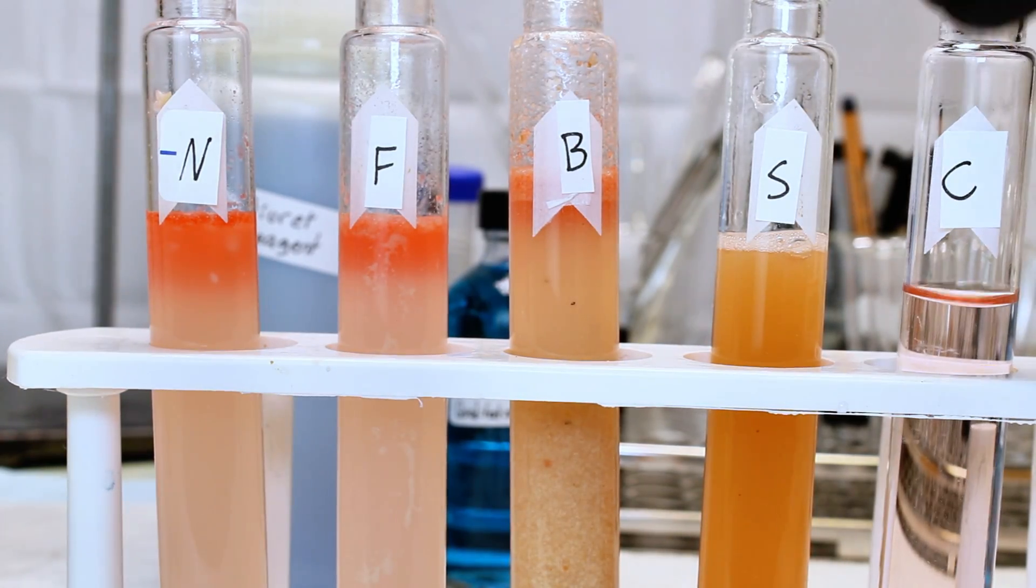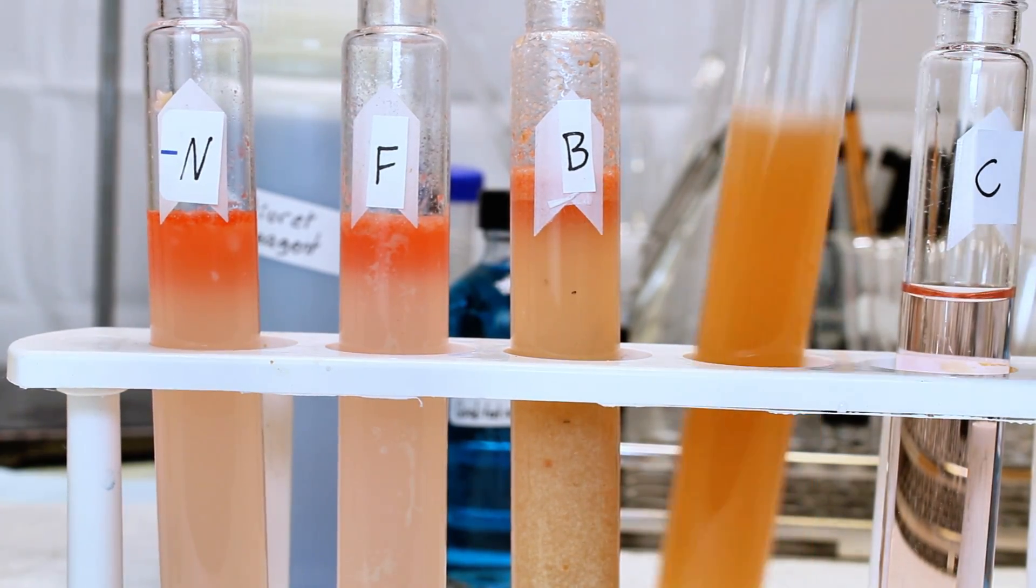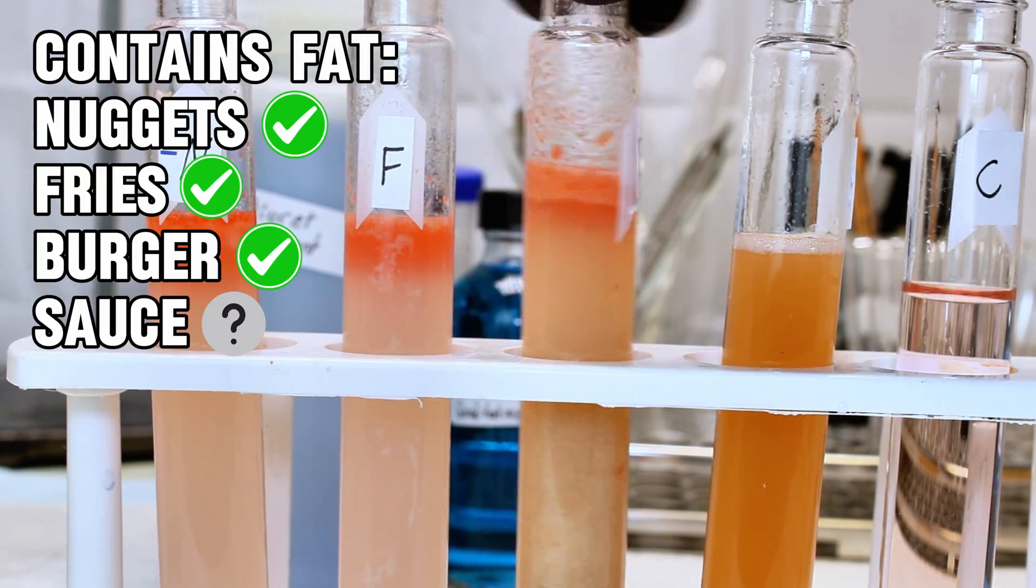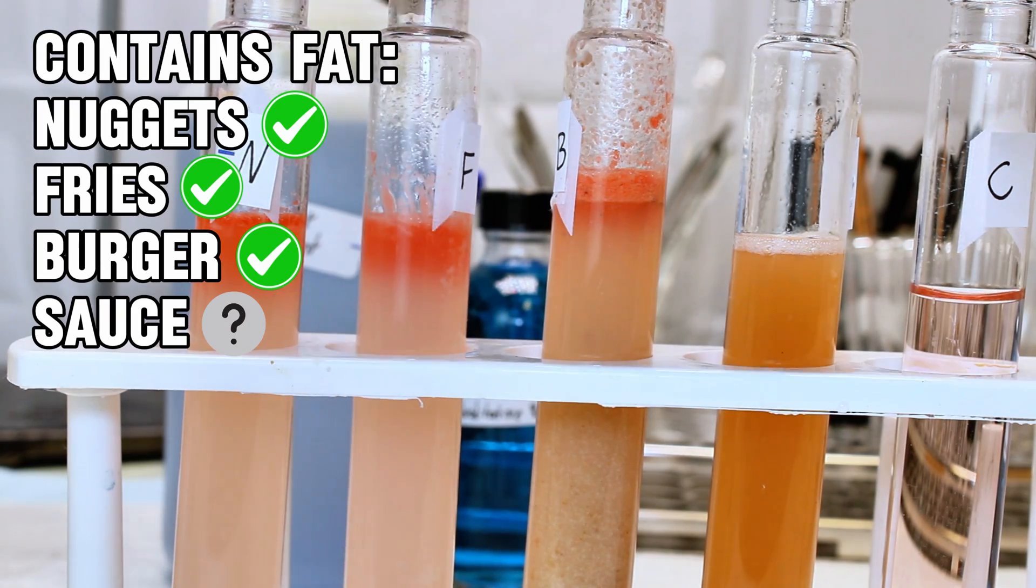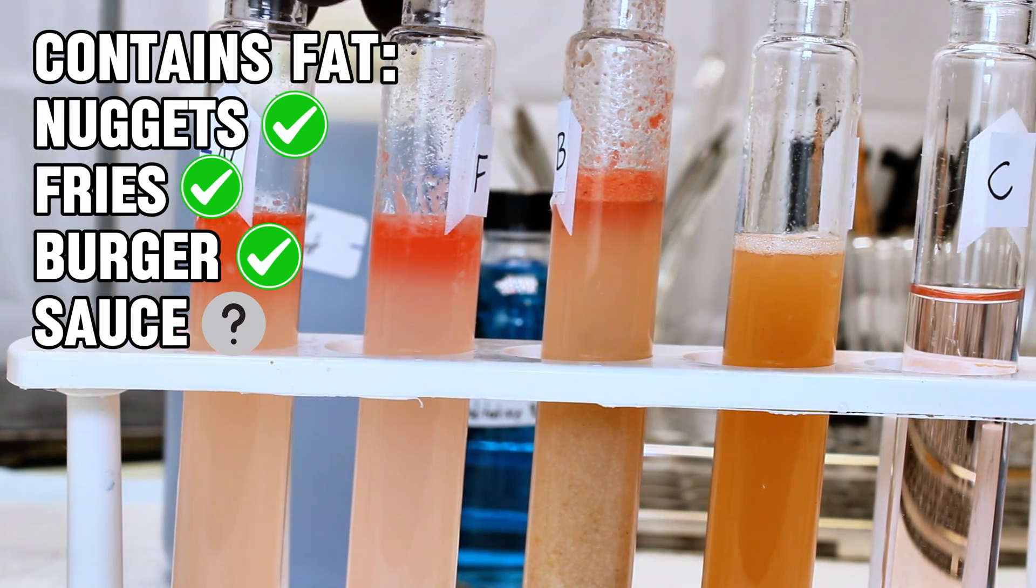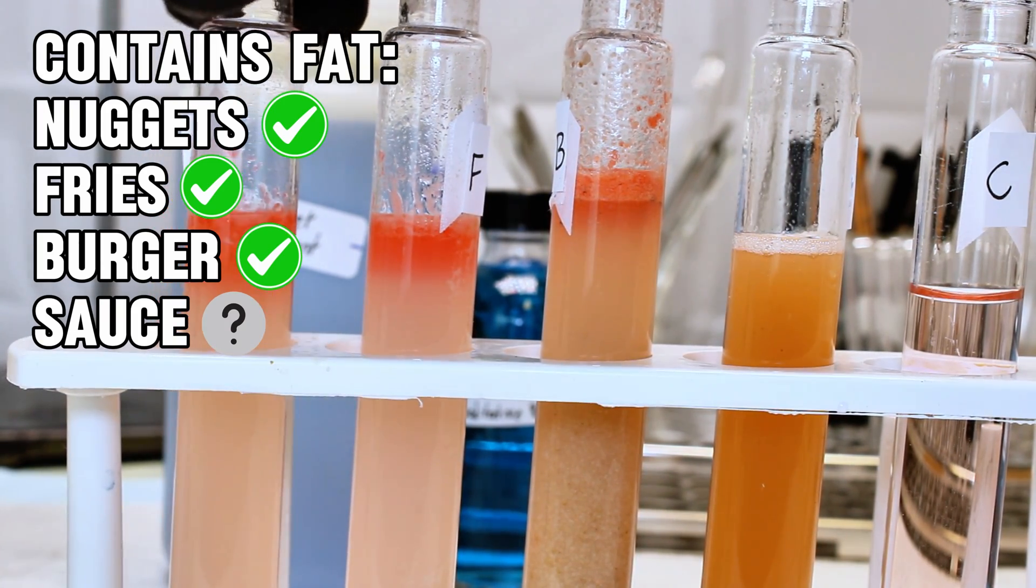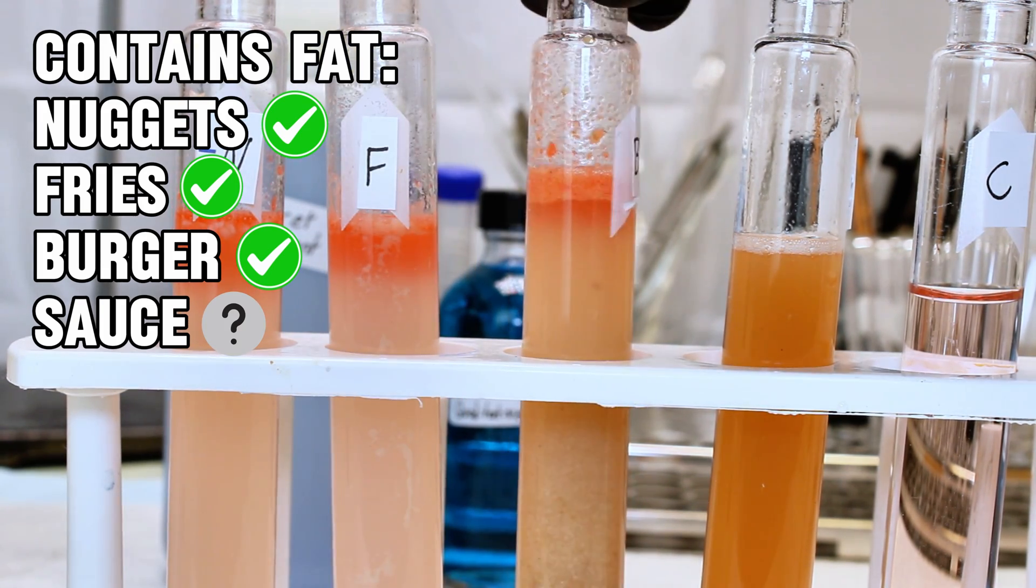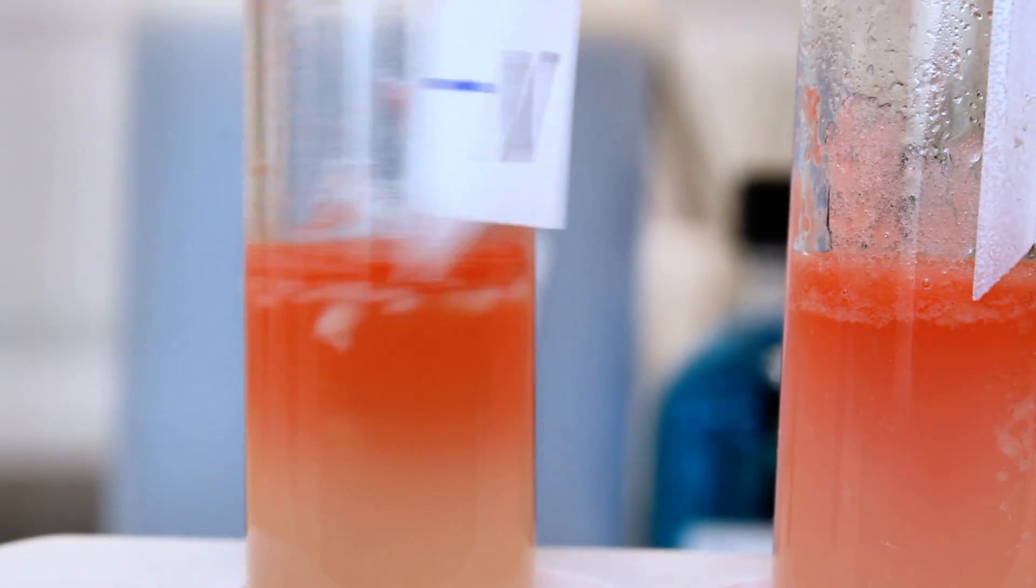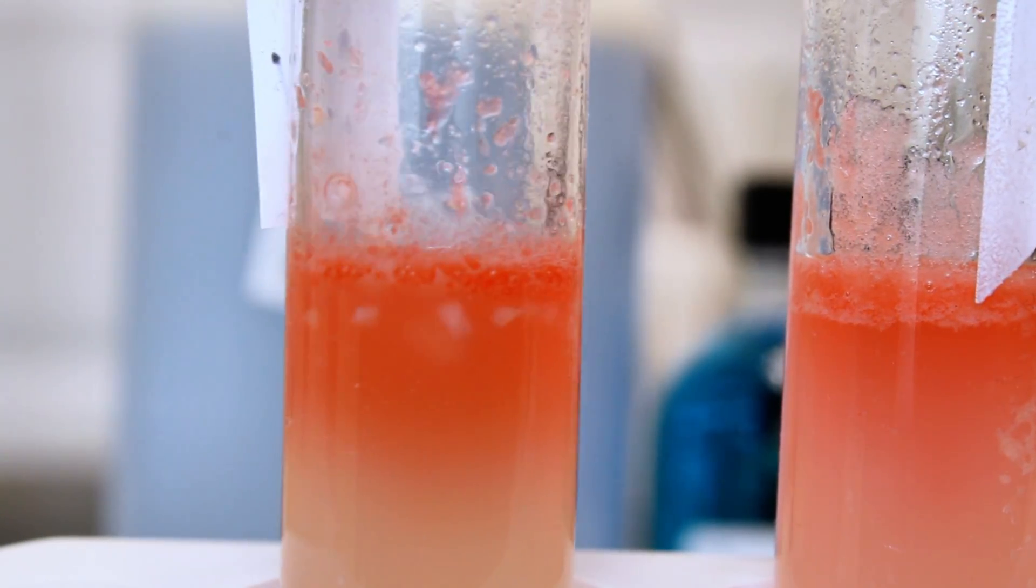Here it's very clear that the fries, burger, and nuggets all contained lipids or oils. The sauce was actually negative here, but it could be that the sauce itself already contains an emulsified oil, which this test wouldn't be able to detect. There are other tests for lipids, but none to my knowledge are particularly as vivid and distinct as these other tests.